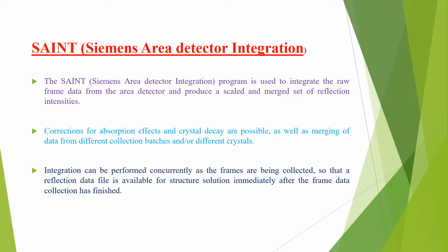SAINT, Siemens Area Detector Integration. This is another software tool that is used in the single crystal X-ray diffraction technique. The SAINT, that is Siemens Area Detector Integration program, is used to integrate the raw frame data from the area detector and produce a scaled and merged set of reflection intensities.